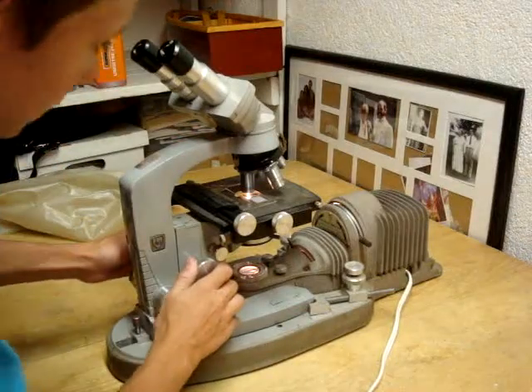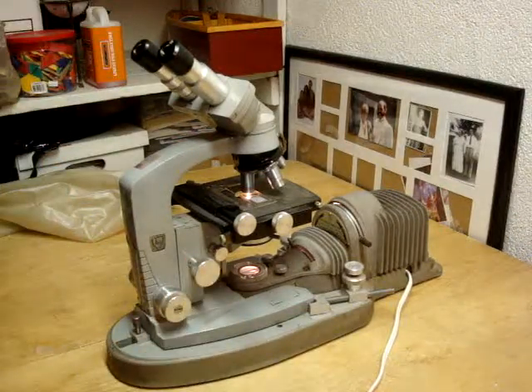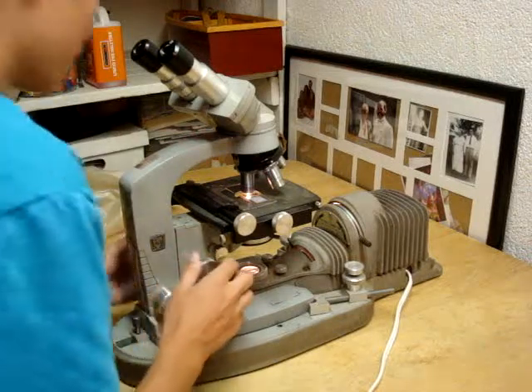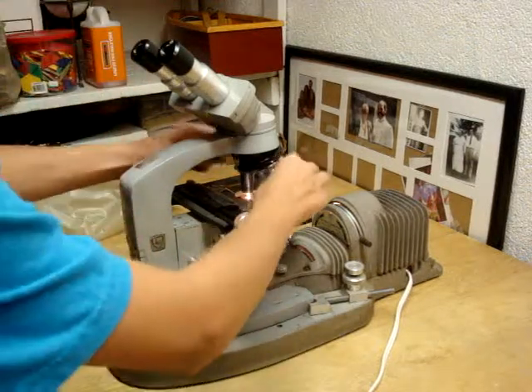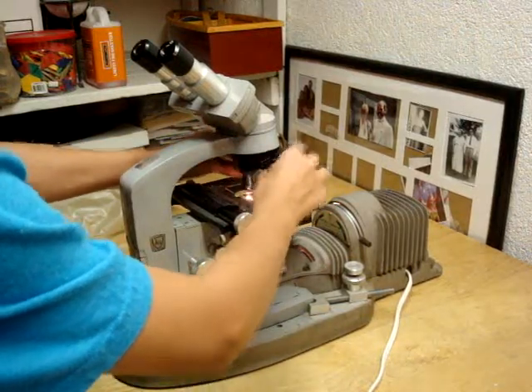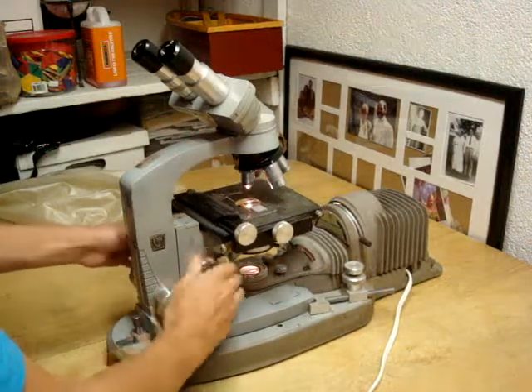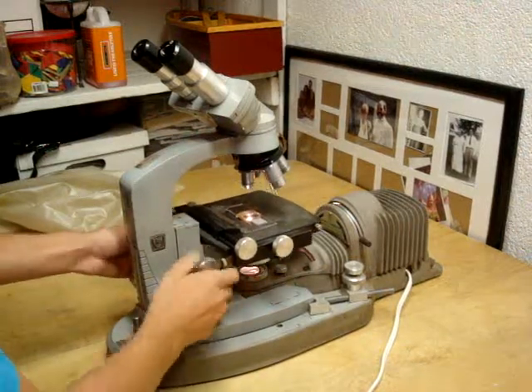Now once you are done, the next one is an oil objective so I don't really want to use that one because I don't have any oil. But now what you want to do is switch it back to the low power objective and turn this all the way down just like this.